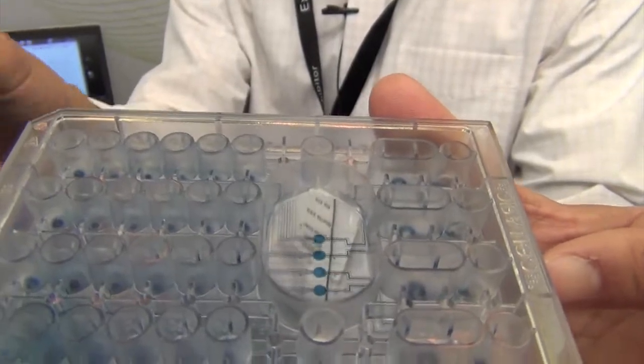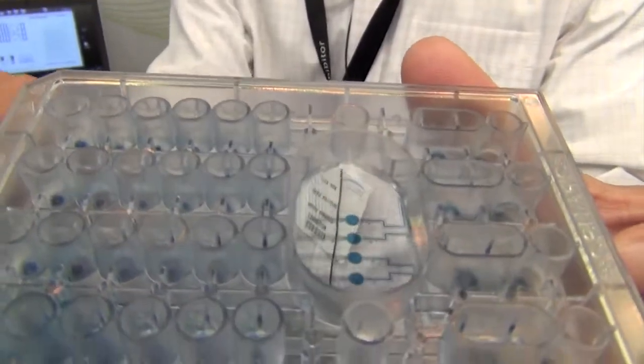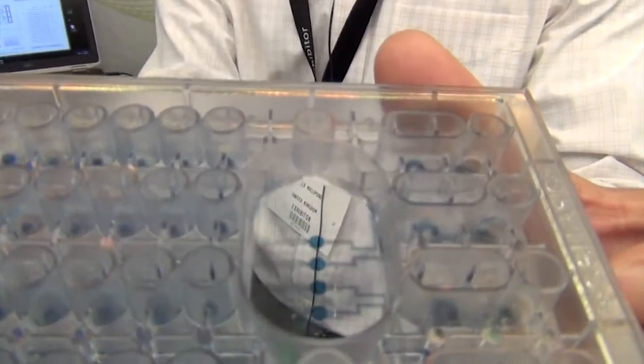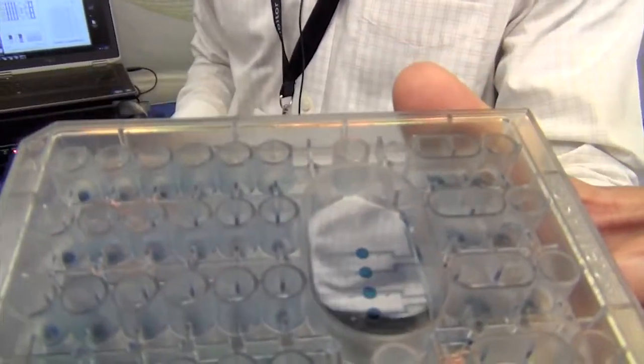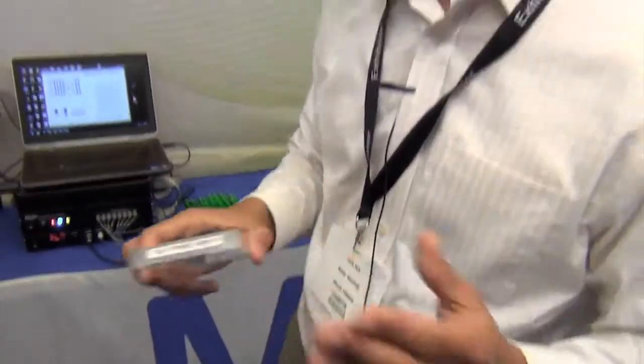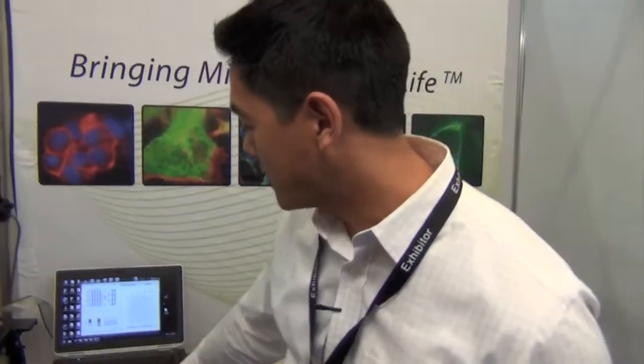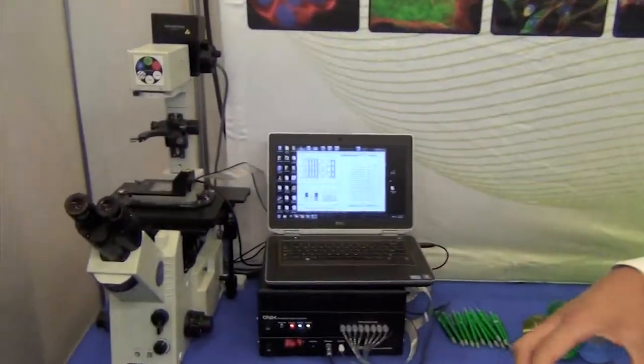There are four rings, those are four independent rings where your cells would be loaded in, and that allows you to view your sample over time. So at this particular conference we're showing our system which is called the onyx system, which essentially mates to our microfluidic plate.